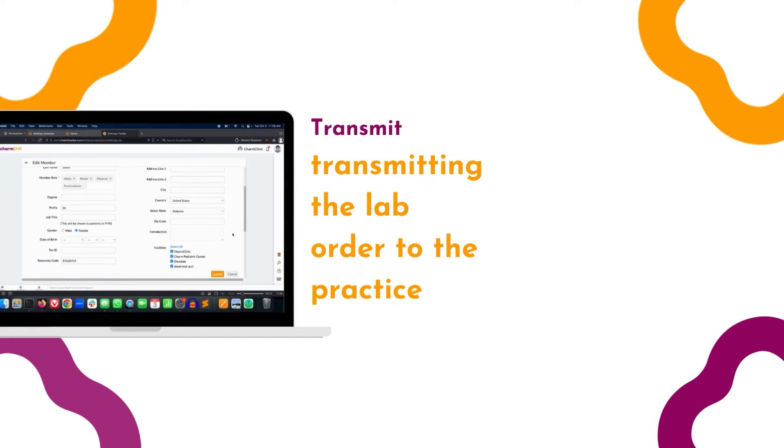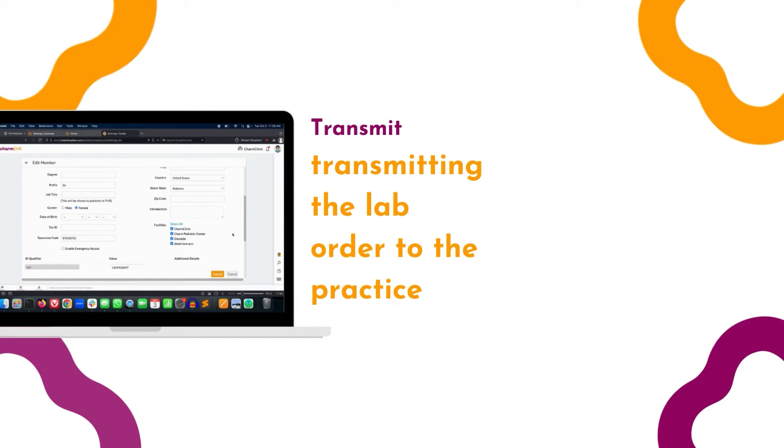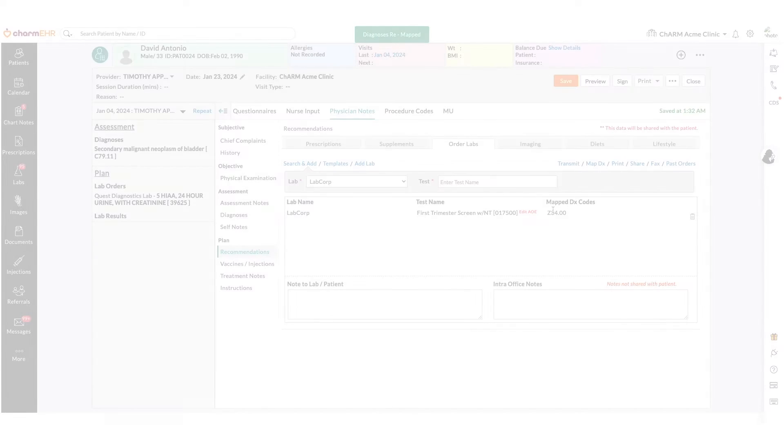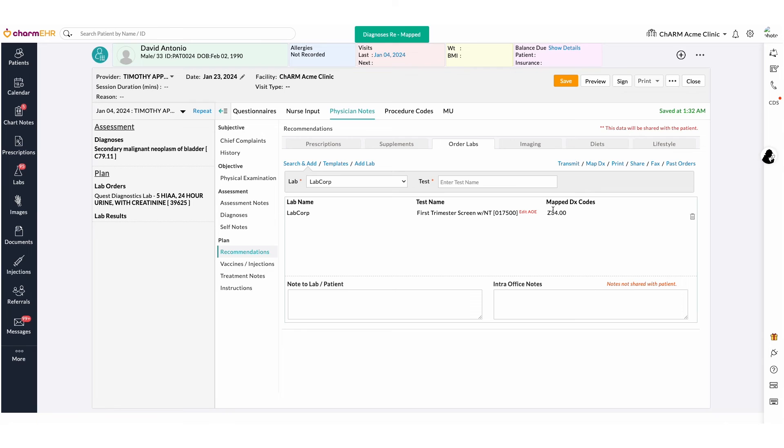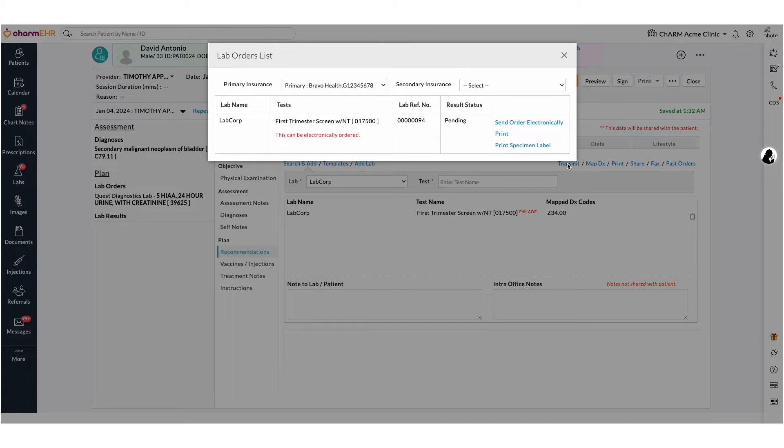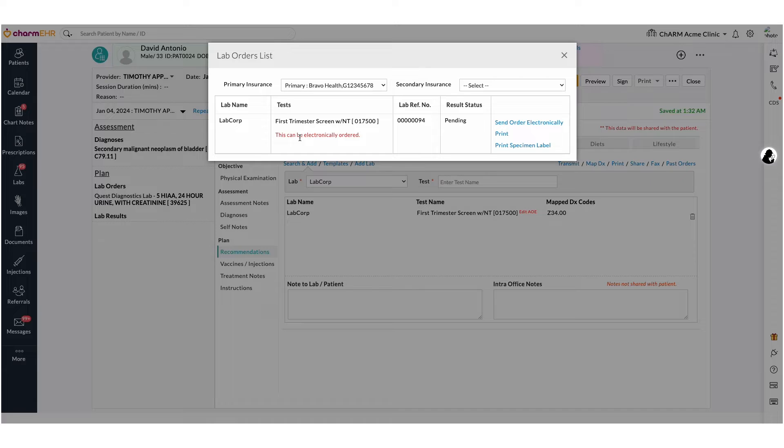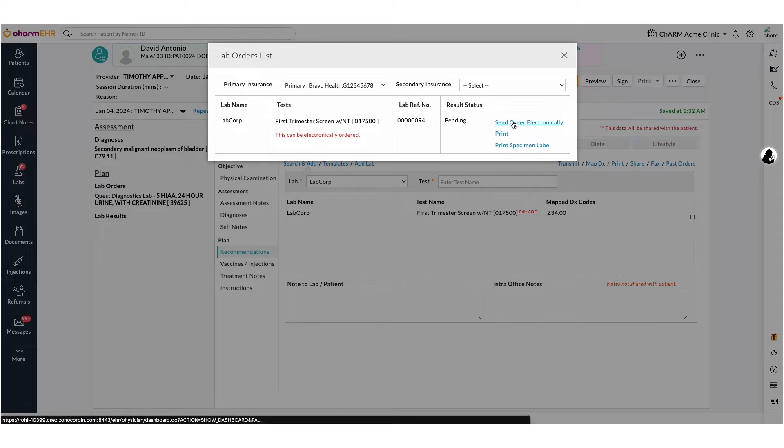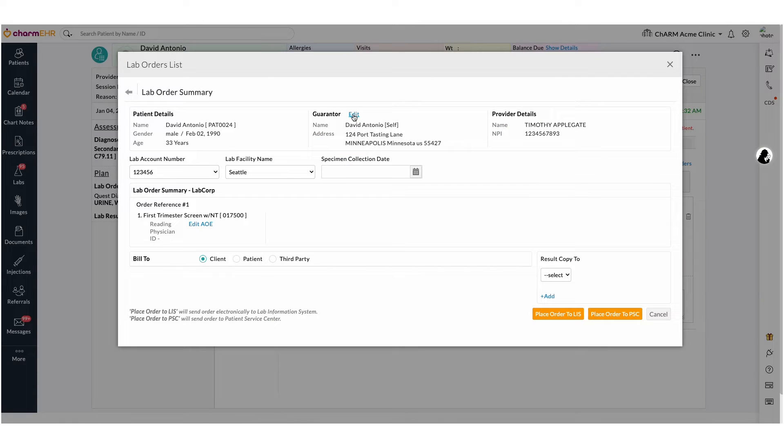Transmit Lab Order. To electronically transmit the chart note, add all the tests and use the transmit function. In transmit view, lab orders added to the chart note will be listed. The Send Order Electronically option will display the lab order summary view. Here you can verify the details of the lab order.